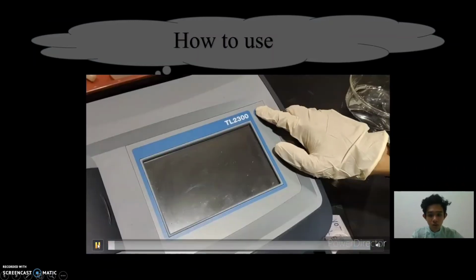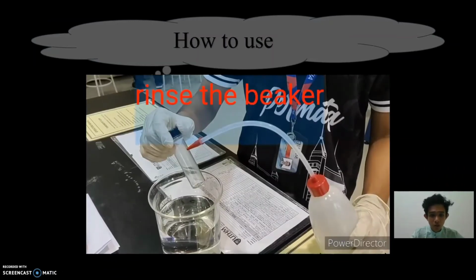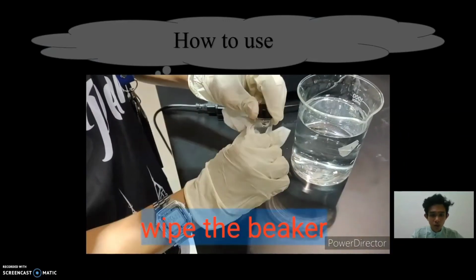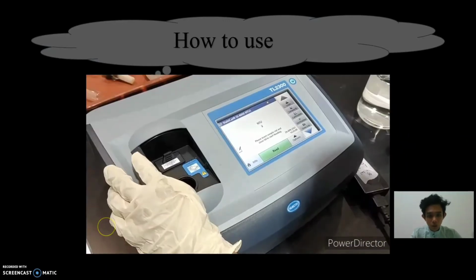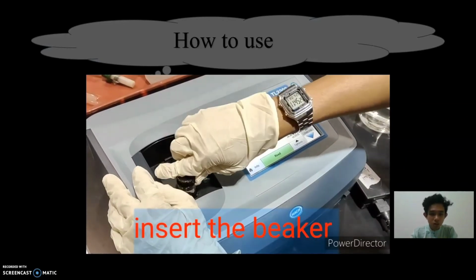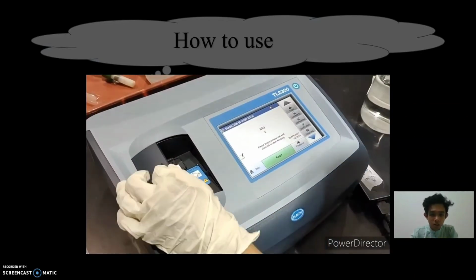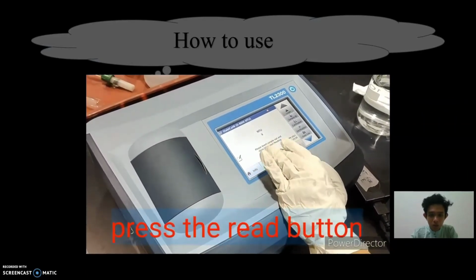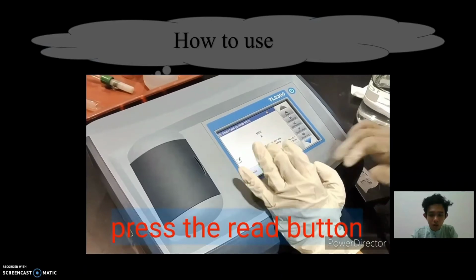First we have to turn on the switch, press the button on, rinse the beaker before we fill it, wipe and insert the beaker in the turbidimeter and press the read button.